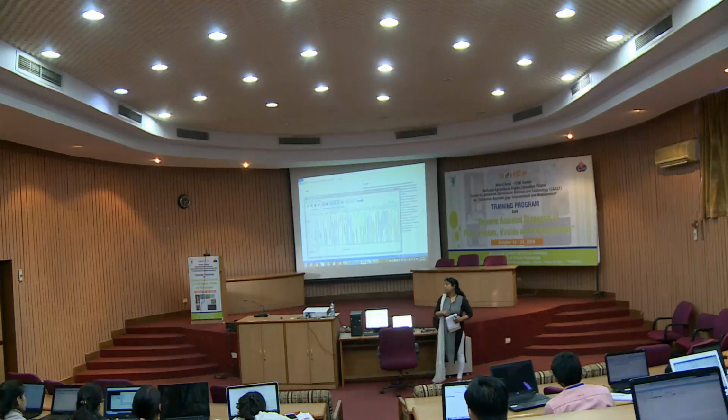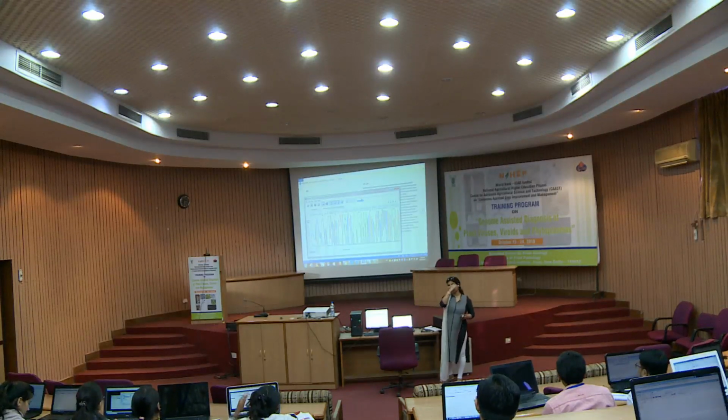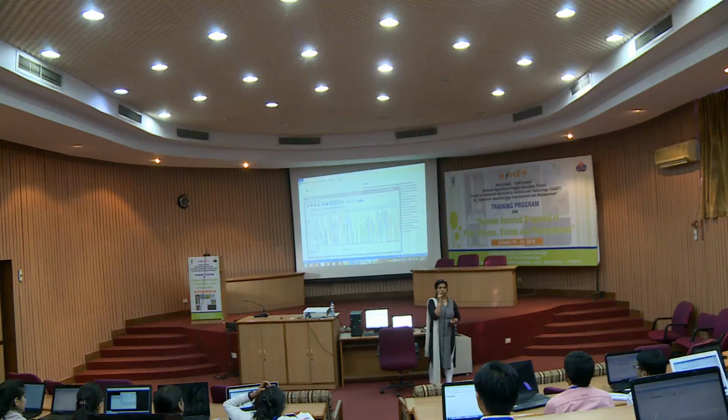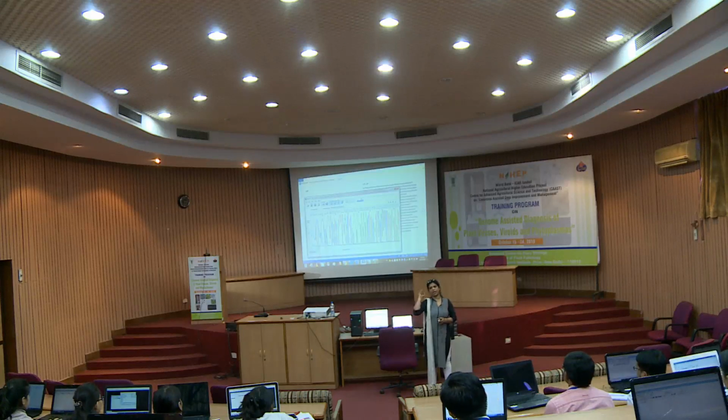Okay, one more thing. Let's suppose at some point the data is not good. We have forward and reverse sequence. In one sequence the software is reading C, but in the other, reverse one, it is reading A, suppose.